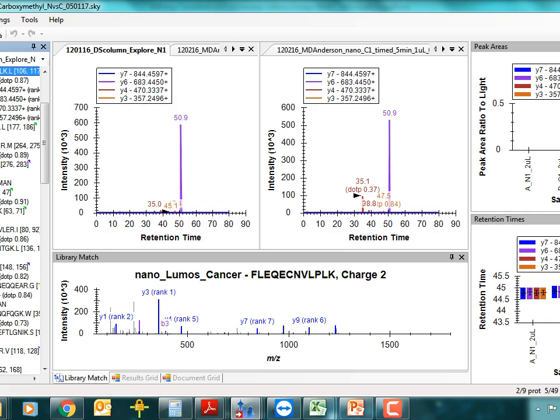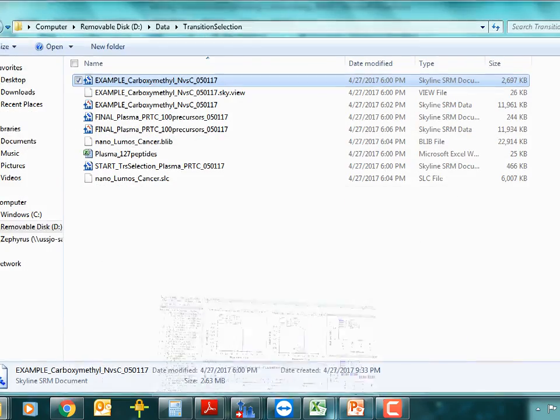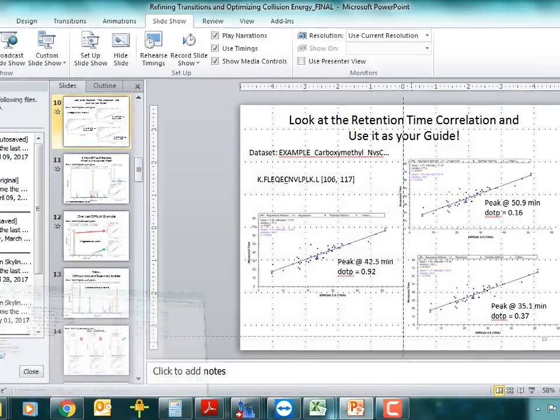And if you look over here on the right, you can see the report on the dot products of all the peaks that are being shown. And so you can look and see if there's a better option than what Skyline picked by default. Okay? And so this is kind of like data without human intervention at this point. So that's a file that you can walk through with these slides, or if you have questions about them later, that's the one that gives a good example.